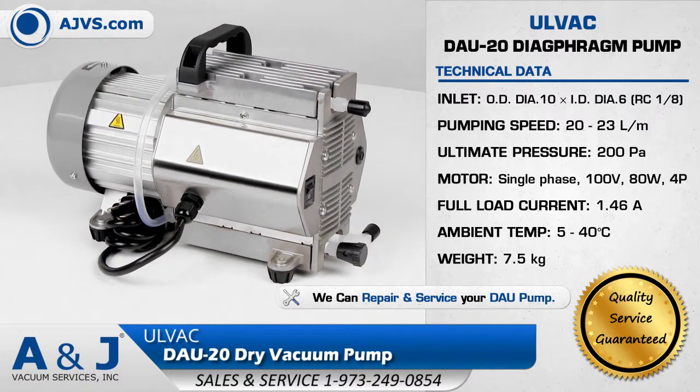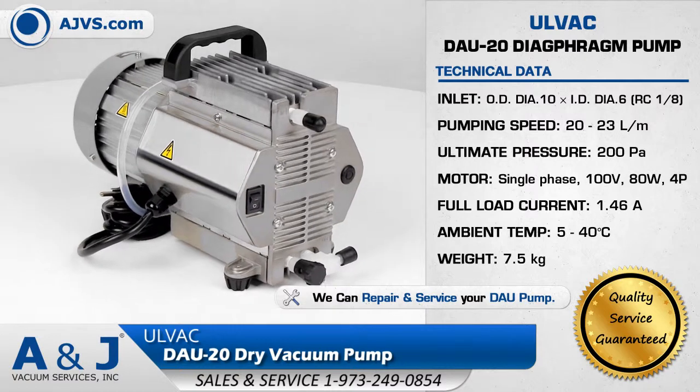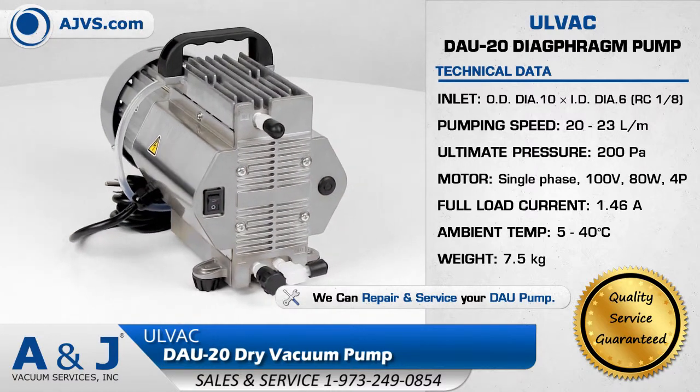It is maintenance-friendly and has a long service interval, making it an efficient dry vacuum pump for today's most demanding work environments.